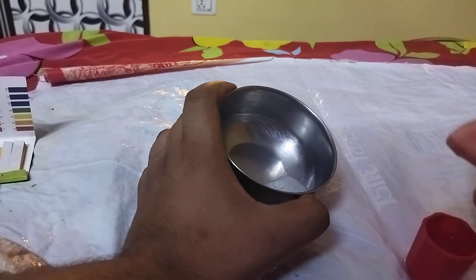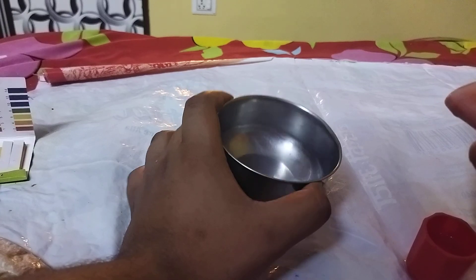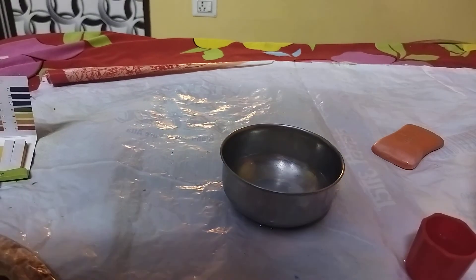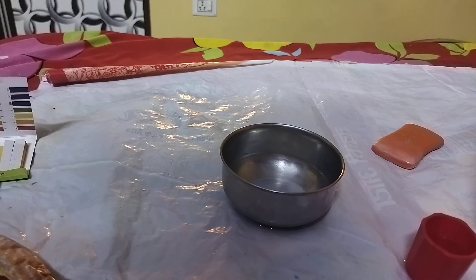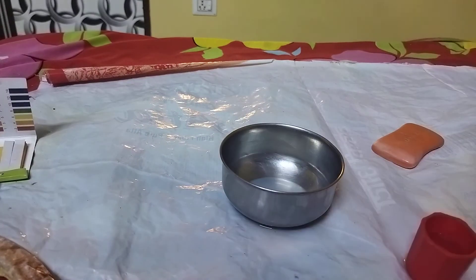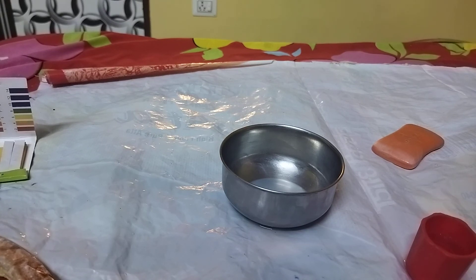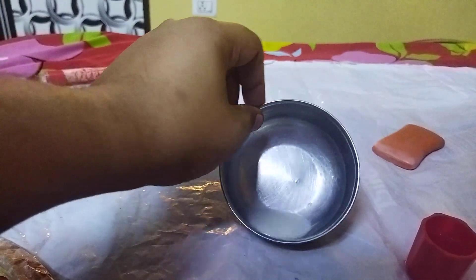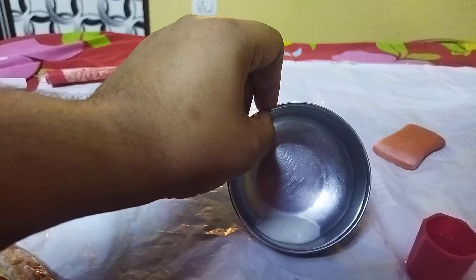Let's wait for the bubbles to pop up and settle down. Let me clean my hands. Now I can see the bubbles have popped out and the solution is pretty stable.